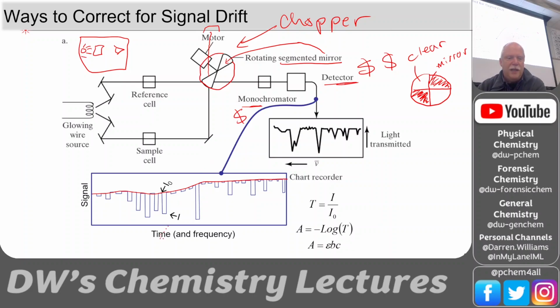So if you were to plot this out by time, then you would see, this up here is I naught, and then this down here is I. And so you're plotting along. So if you're also scanning the wavelength in time too, then you would see that this is a peak here, and then this is a peak.